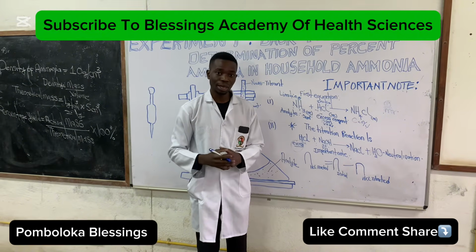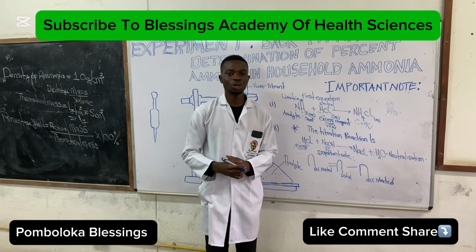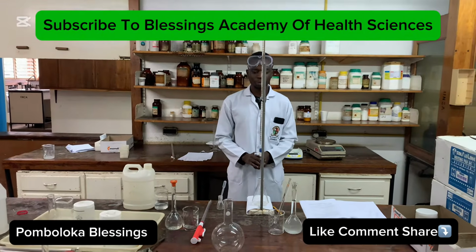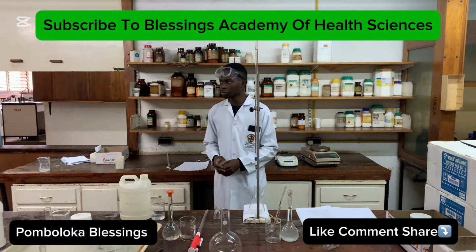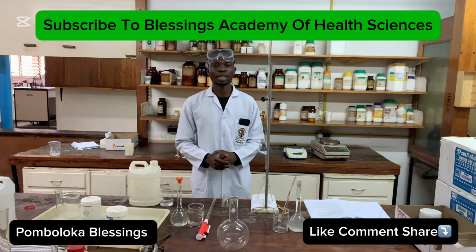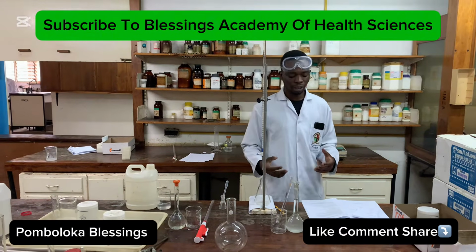So now let's get back to the entire course of the practical and find out exactly what we're supposed to do. All right, so in this session, we want to look at the technicalities of the procedure. We want to start first of all with the second part of the experiment, because we are looking at an important reaction here, which we're calling back titration.